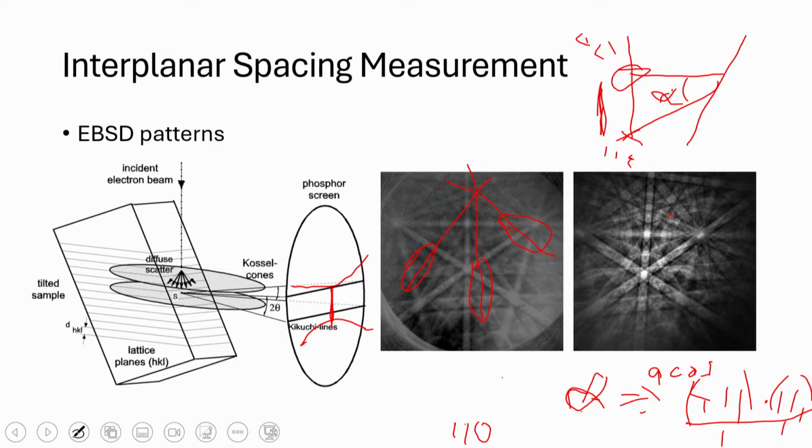Right? So if I take the phosphor screen and move it in and out, all the positions on the phosphor screen are going to be moving to different positions, except the pattern center. That position is going to stay the same, right? Because we're moving on a line normal to that phosphor. So where that detector is, the point normal to that, if we're moving along that normal line, then that position stays exactly the same and everything else distorts around it. Right? That's the definition of that gnomonic projection.